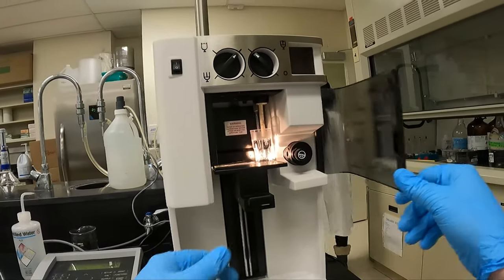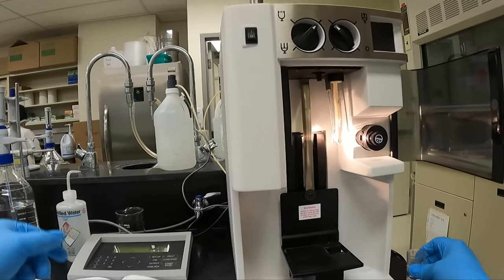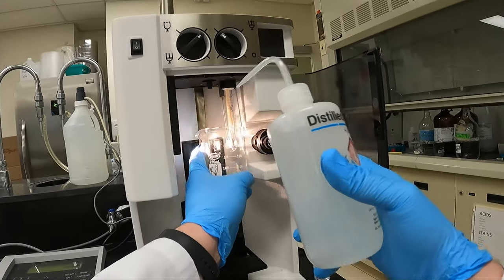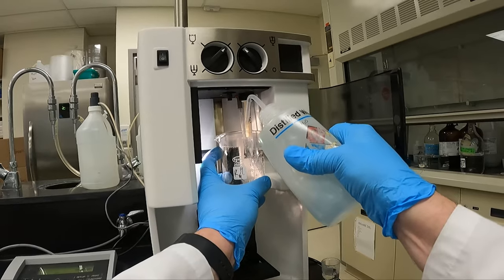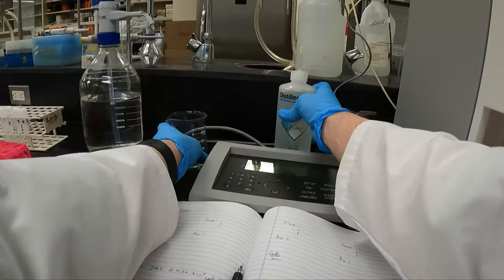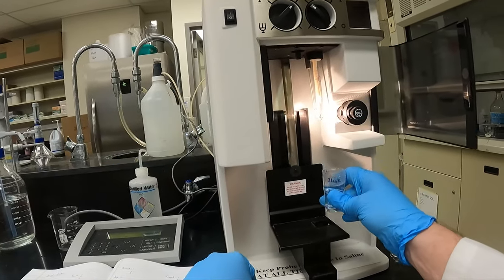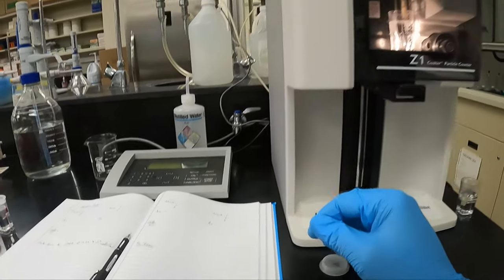We'll now count the cells on the Coulter counter. We'll start by washing the probe with distilled water. We're using the beaker to capture the water so it doesn't make a mess in the machine. We'll then run the blank three times to get an idea of what the background noise is from the probe itself.